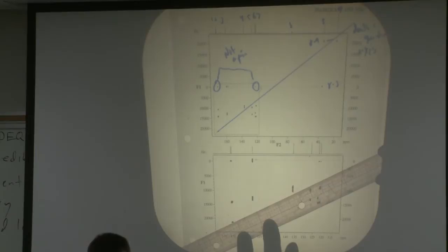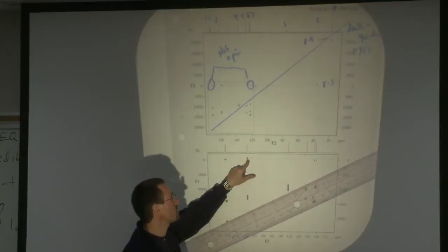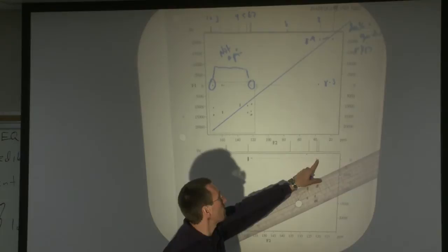What's interesting here is this is our carbon doublet. You see that, that's your CC coupling. But here, these are singletons. These are spots. They're not doublets. So whatever it is, it's not J1 CC coupling. We have a spot under here.